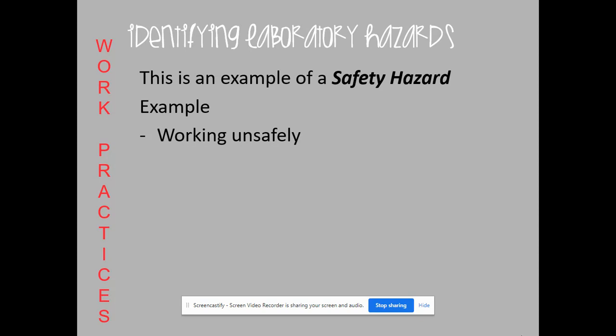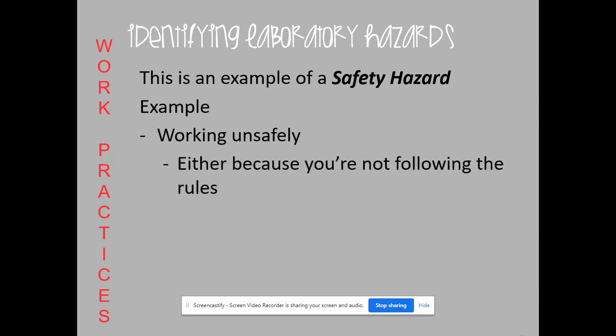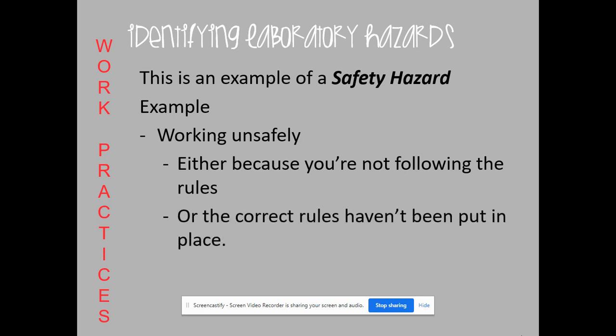Okay, so what kind of example is this? Literally working unsafely. Okay, either because you're not following the rules or because the correct rules haven't been put in place. And how can we reduce the risk? If you don't know, ask.